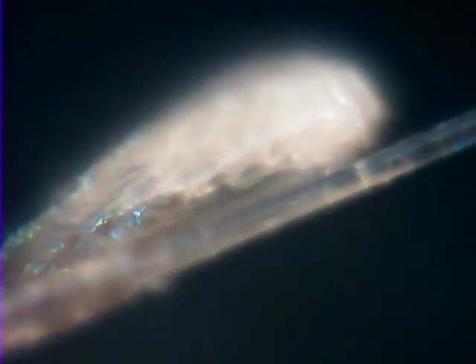Now this is it in black and white, so you see how half of it is grey — that is not the knit. And on the top it is the knit. And see those shiny glimpses? Well, that's my hair.